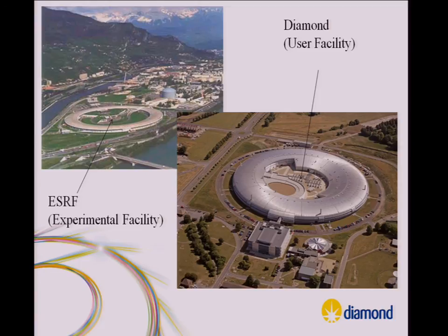We have file loaders contributed by a service, and you have an extension point to say, I want to load a file of this type, and you have an interface to implement, and then the rest of the code pulls the file loader service and says, give me the data from that file. So that's how we extend stuff. Our collaboration is across several facilities, and two of them have their own file types, so they write their own loaders for those, and then it's just a case of pulling it in.